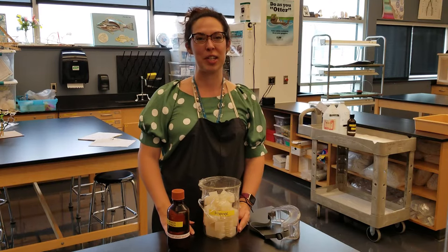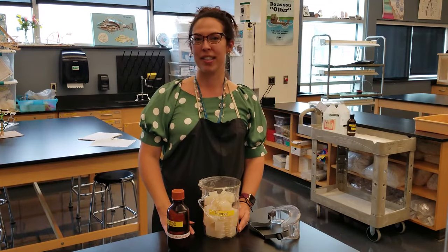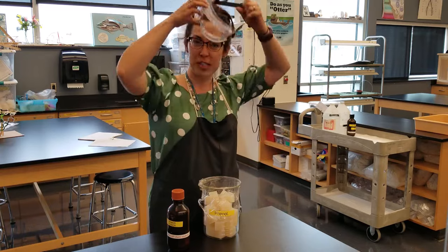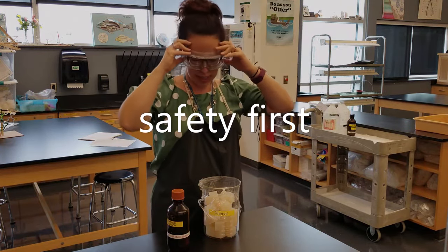Hello, today we're going to demonstrate a lab we call cell size efficiency, also known as the Jello Jigglers lab. I want to put on my safety goggles, which fit comfortably over my eyeglasses, so that I can protect my face.